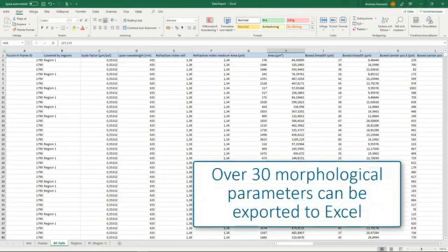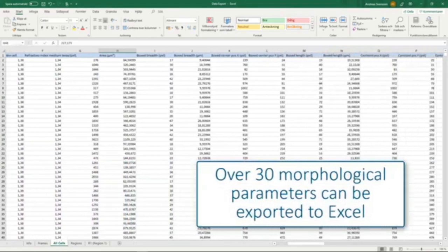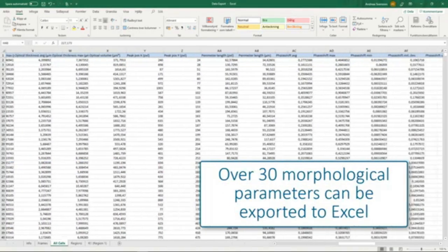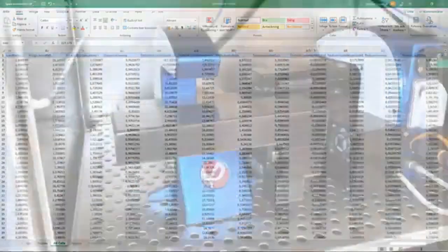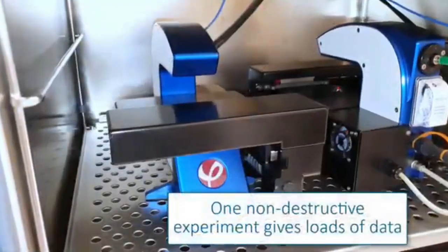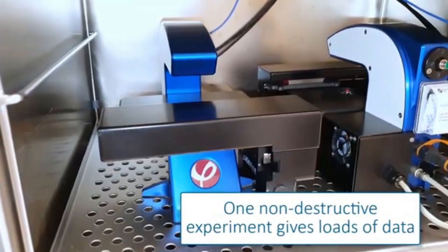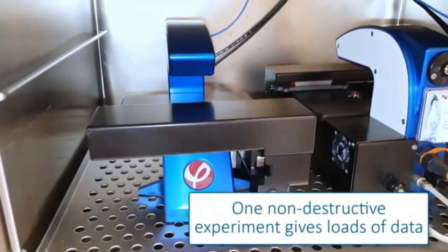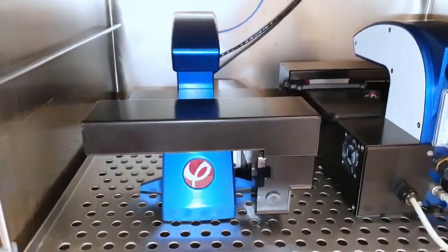All of these parameters can be exported to an Excel file if you want to analyze the data further on your own. With Holomonitor, you save both time and money by getting all necessary drug effect data for one single experiment without wasting any cells.